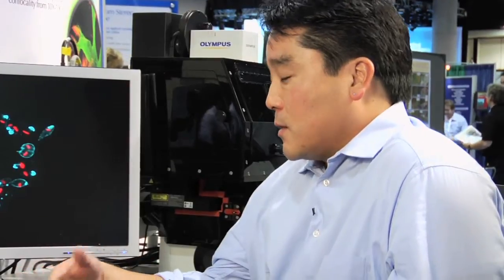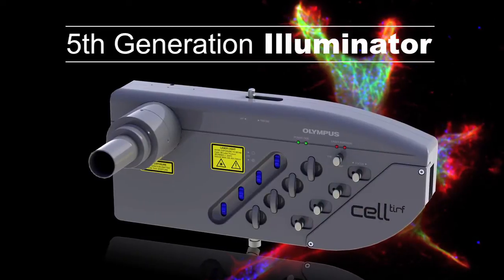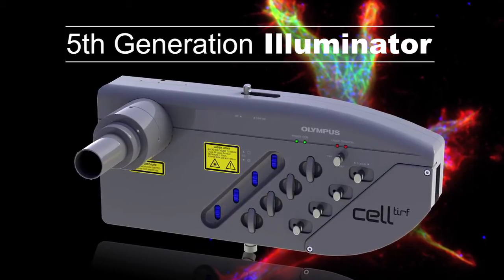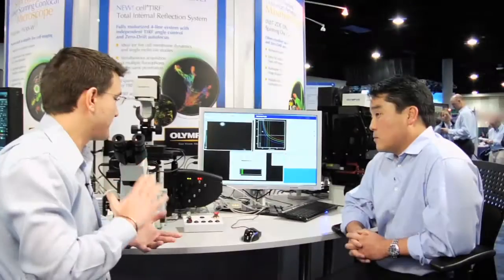So the new system, the motorized cell TIRF illuminator, talk to me a little bit about that. What are the advancements that you made with this new illuminator? Yep. So this is the fifth generation of TIRF illuminator. Two years ago, we introduced our two-line and three-line manual systems. This is actually a four-line system now, which is fully motorized. So some significant advances from the old systems.